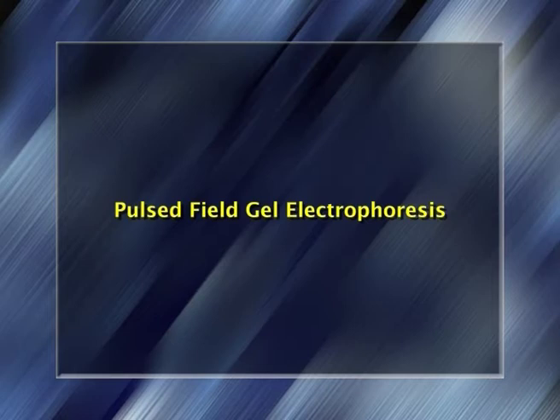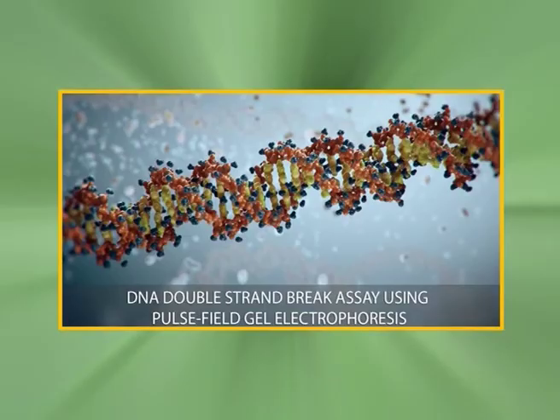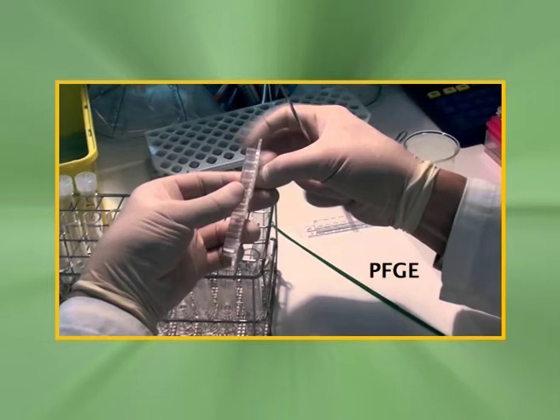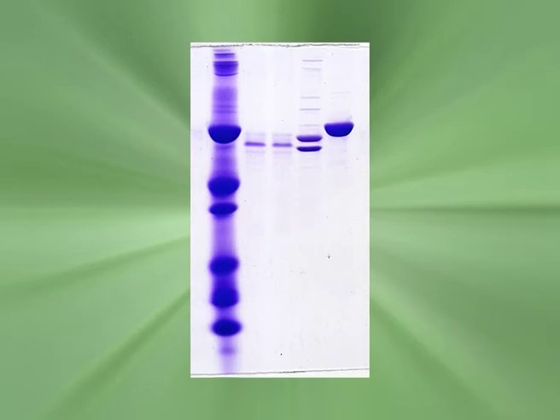Last one is pulsed field gel electrophoresis. It is a technique used for the separation of large deoxyribonucleic acid, that is DNA molecules, by applying to a gel matrix an electric field that periodically changes direction. While in general, small fragments can find their way through the gel matrix more easily than large DNA fragments, a threshold length exists above 30 to 50 kilobase pairs, where all large fragments will run at the same rate and appear in a gel as a single large diffuse band.